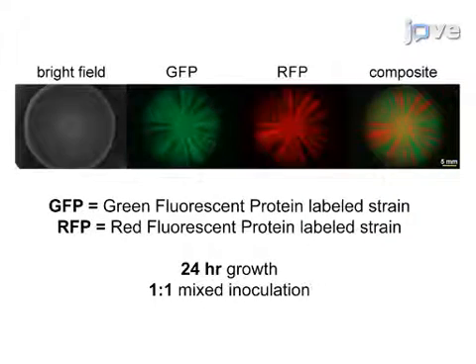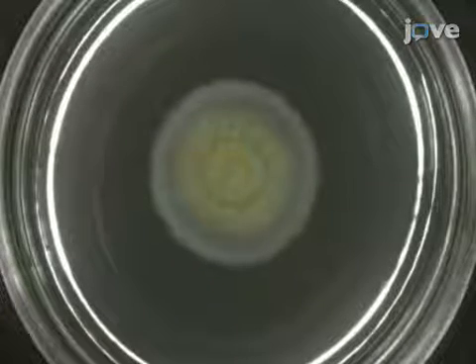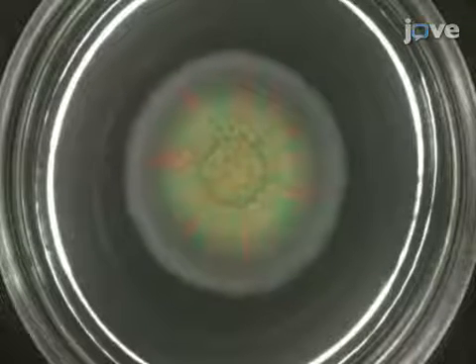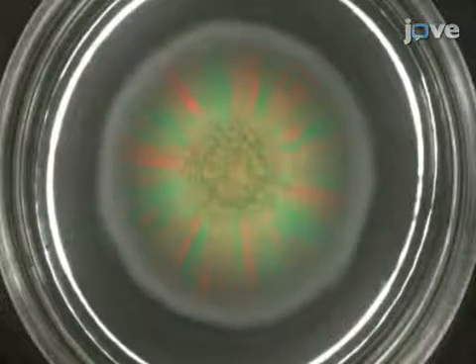Conversely, images of sliding behavior show defined sectors of growth corresponding to the differently labeled fluorescent strains. This video shows the growth of a sliding co-inoculated colony in which the strains lack functioning flagella. These colonies are still able to spread using a combination of secreted exopolysaccharide, hydrophobin, and surfactant. Resulting colonies display distinct spatial growth assortment compared to the swarming strain.